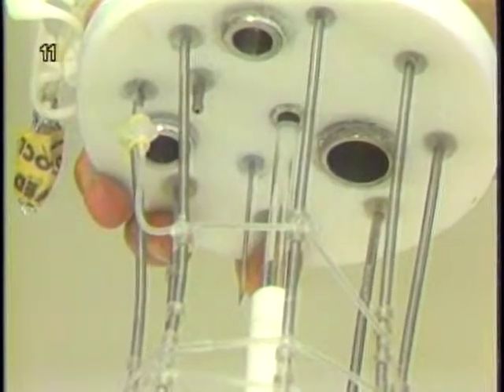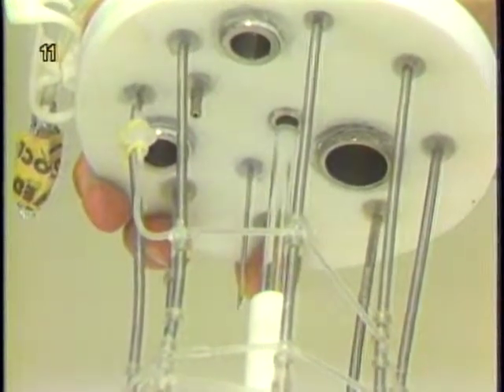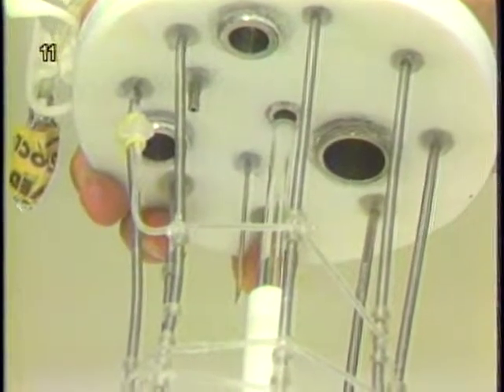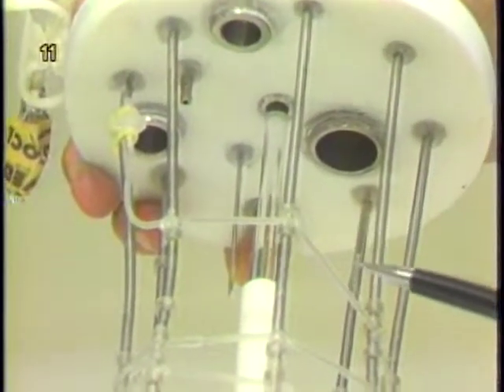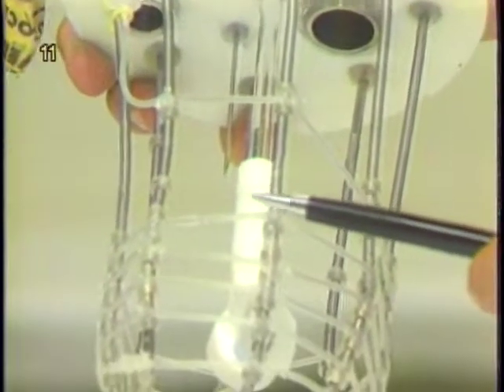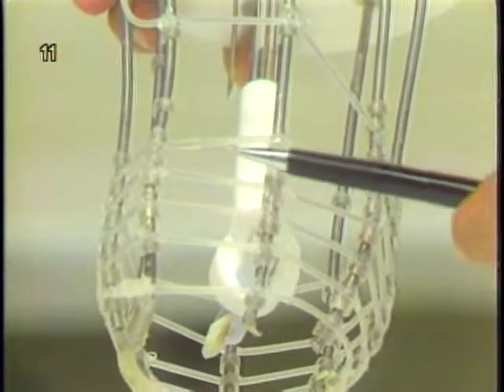In a micro carrier culture, especially in small-scale operations, sparging is often avoided. Rather, the supply of oxygen and carbon dioxide is achieved by diffusion through silicone rubber tubing.